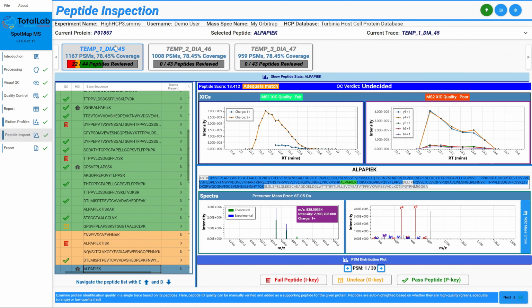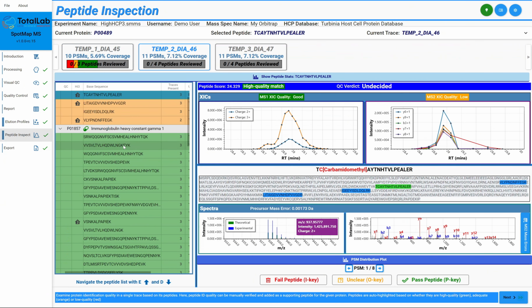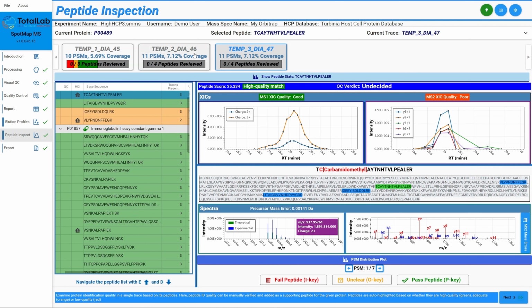As I'm doing it up here, it's color coding all of the peptides that have been detected or a match has been derived from, and it's building up a color chart to basically say how confident we are in the overall assessment of this trace. So we've got our 3 traces here, and we can run through all this manually to say, yes, I believe that peptide match is correct, so this protein assignment is correct, or we can reject it.